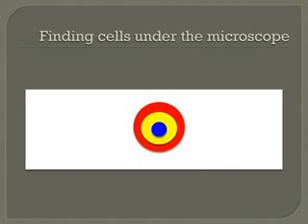Using the blue high power objective lens is 4 times as magnified and probably 4 times as difficult as using the low power objective lens. You're looking at a much smaller segment of the slide, again as exhibited in this picture, and the probability of being off center is pretty likely. One overcorrection with the coarse adjustment and you could completely lose whatever you were just observing seconds ago. Trying to find and then focus on your subject with the high power objective lens without using the scanning or low powers is like looking for a needle in a haystack.